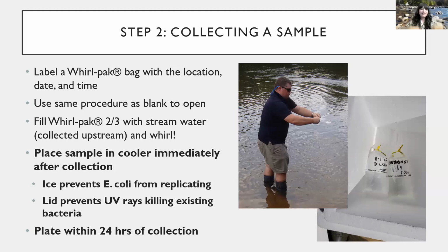But you're going to collect the Whirlpack sample facing upstream because anything downstream from you is going to be impacted by all the disturbance that you just created getting into your stream. And then you're going to collect the water, holding the yellow tabs on the side, and just scoop it up. This is what we would demonstrate in the field during the in-person session, so this would make more sense then. But once you have your sample, just give it a whirl away from your face and then seal it up and put it in the cooler with your blank.